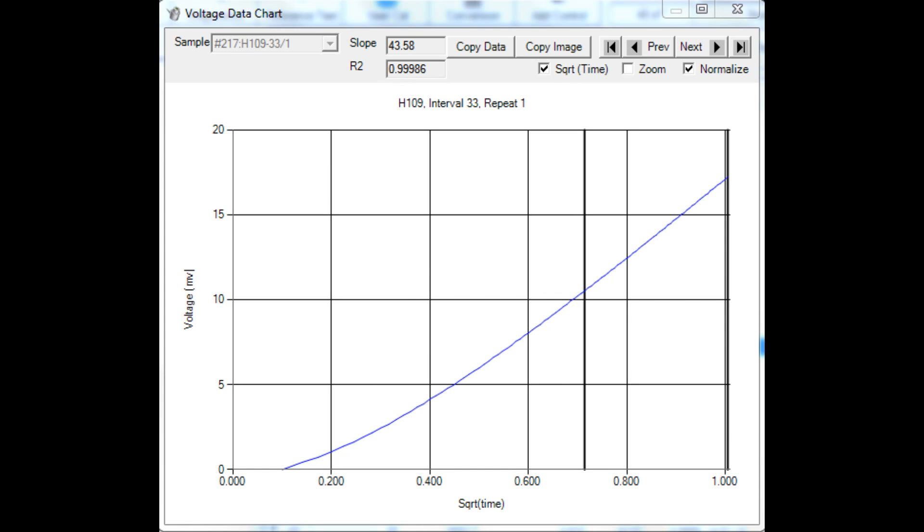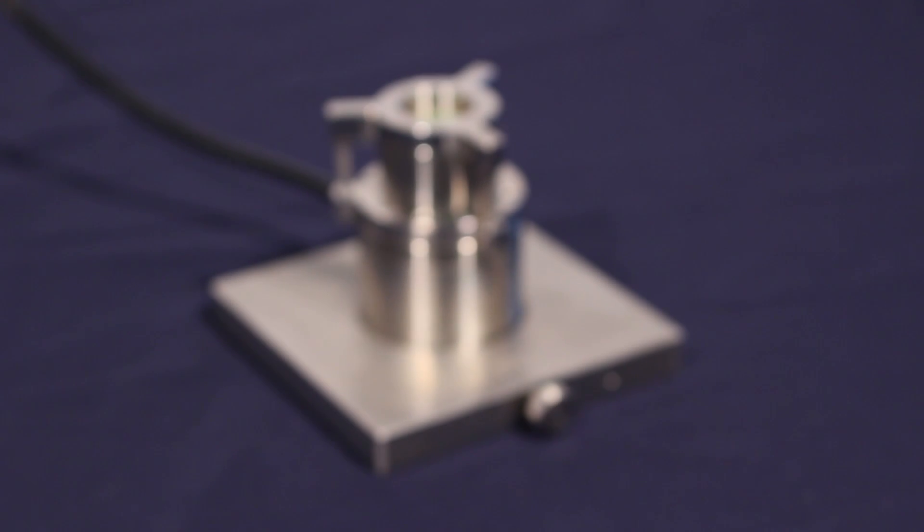Now this measurement takes only about one second as we monitor this rise in voltage, and with this data looking at the rise in voltage over time we can determine the thermal conductivity of the material.